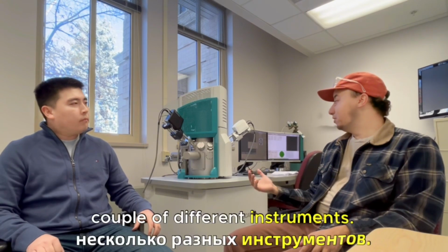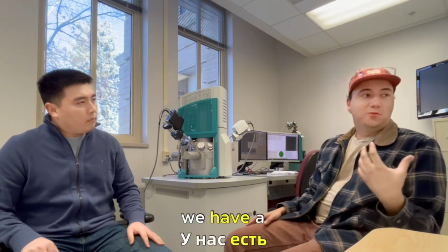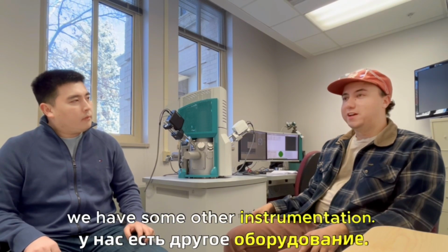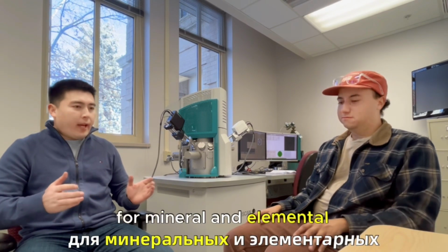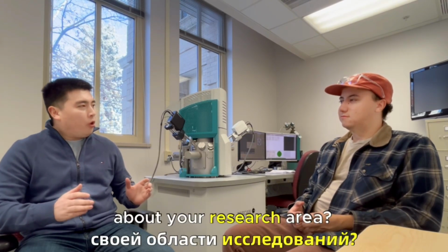So we have a couple different instruments. We have this automated mineralogy system, which is a TESCAN TIMA. Next door, we have a TESCAN MIRA field emission scanning electron microscope. And then down the hall, we have some other instrumentation. Fantastic. So, Philip, as our topic is about application of these techniques for mineral and elemental composition of rock samples, could you tell me about your research area?